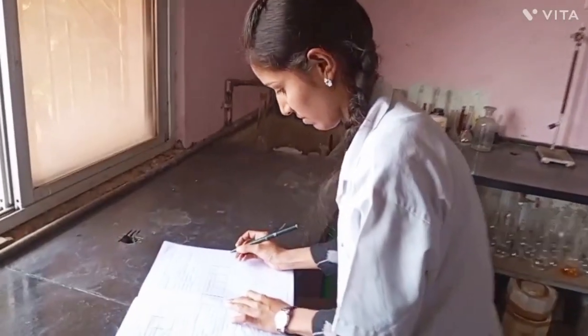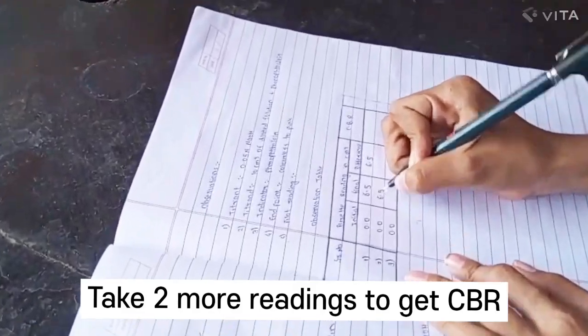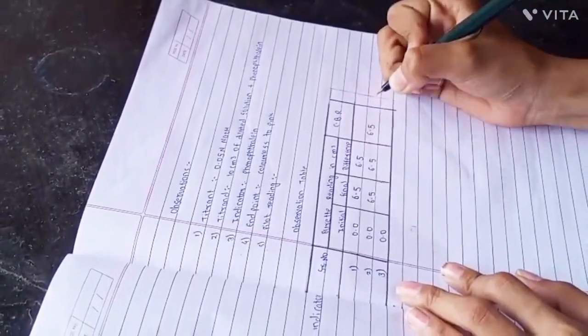Note down the burette readings. Take 2 more readings to get a constant burette reading. The CBR is 6.5 cm³.